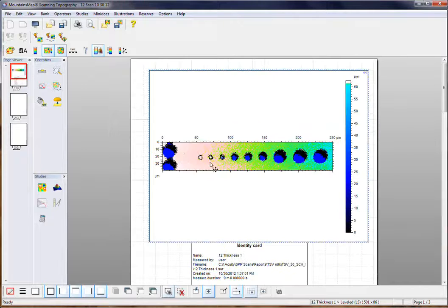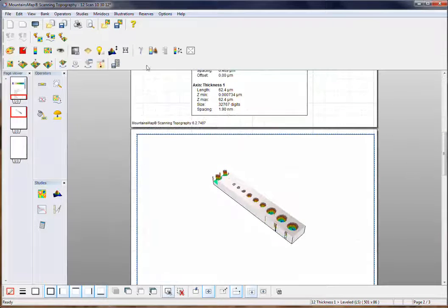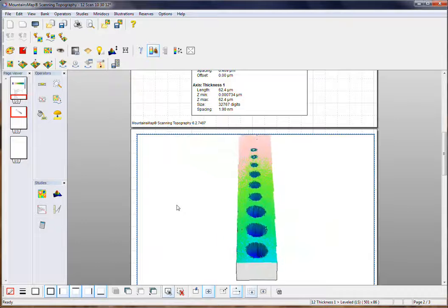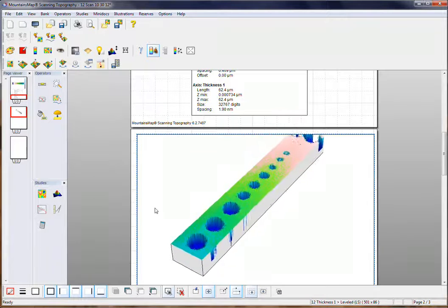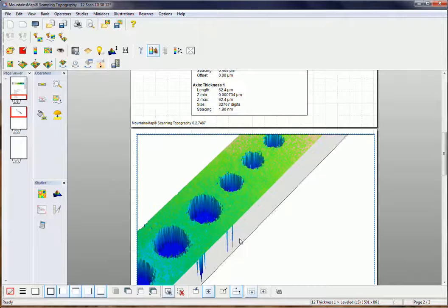We'd also like to show, just to give you an example, some of the surface roughness profile capabilities of this sample. So first, let's go ahead and take a look at this in 3D. And here you can get a feel for what the probe is doing. We basically went every half a micron and took a data point.